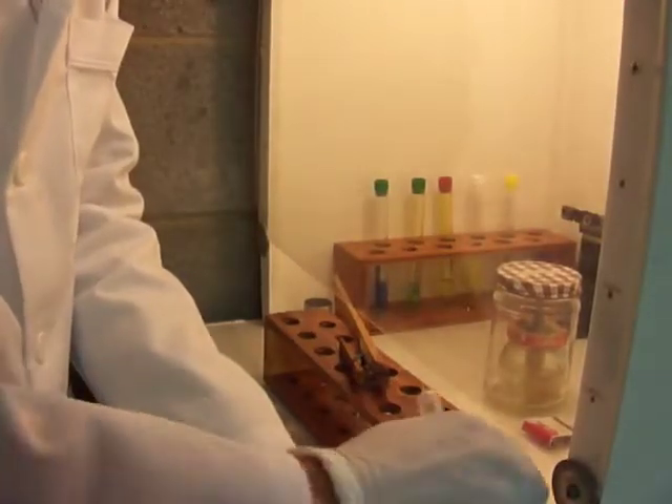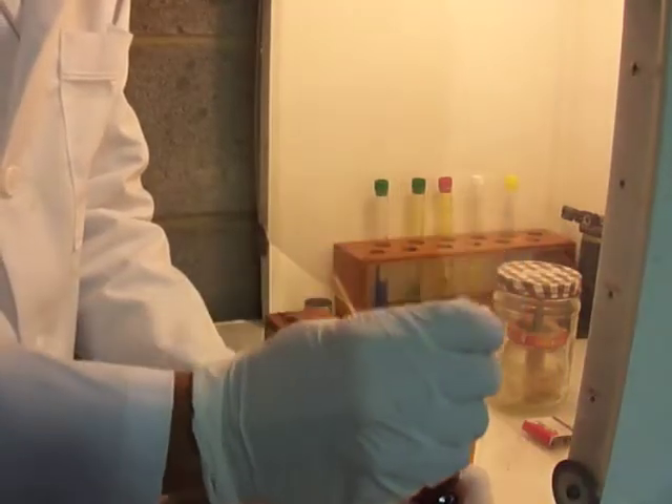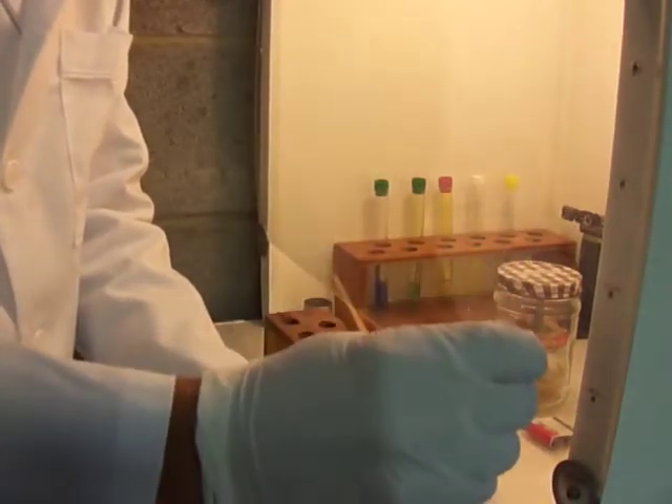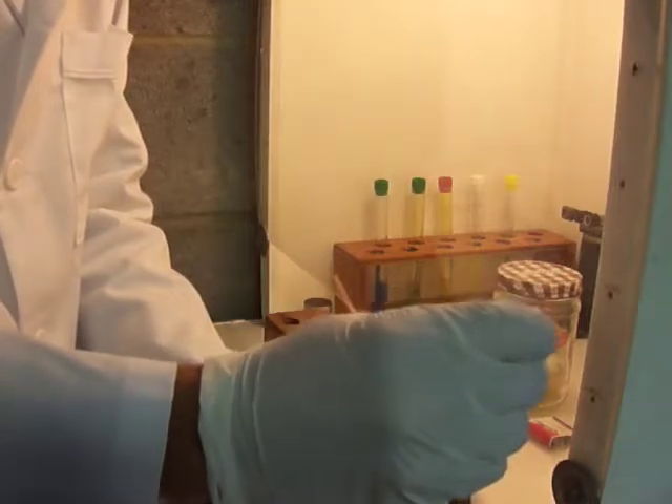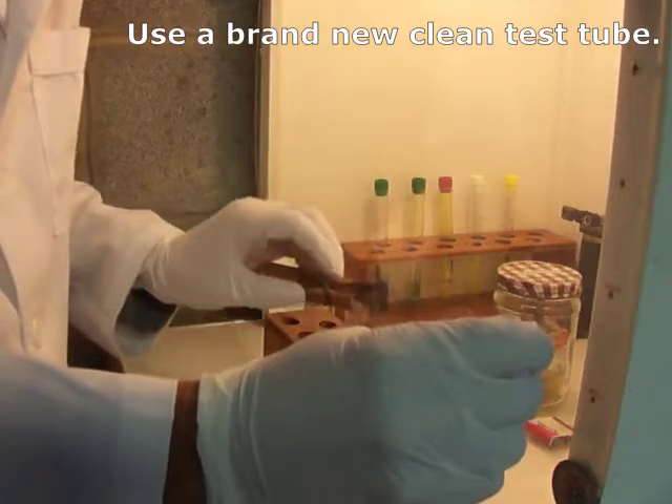I'm going to add about a mil of concentrated sulfuric acid — actually a little bit less — to this test tube. I'm going to try to be careful not to get the edges of the test tube wet. That way we can see if something etches.